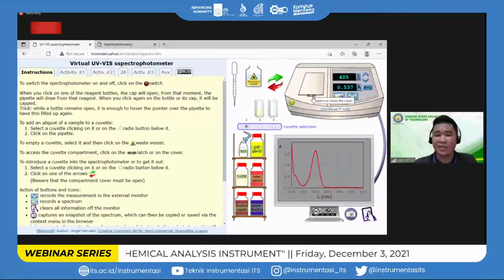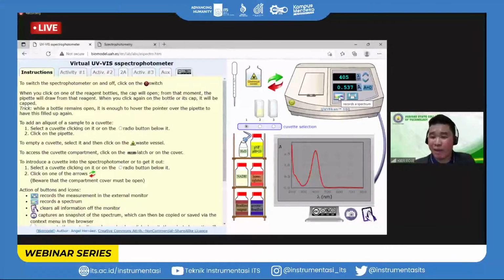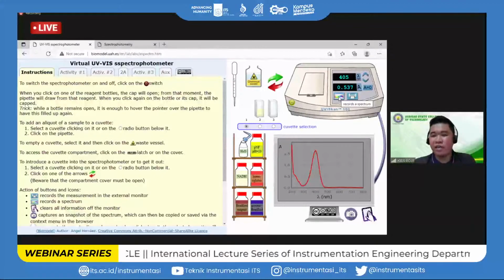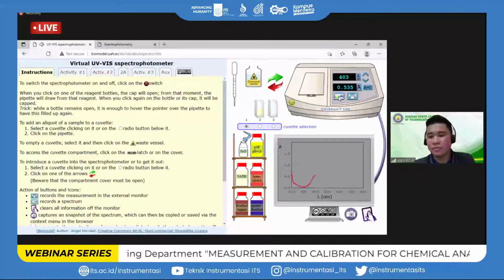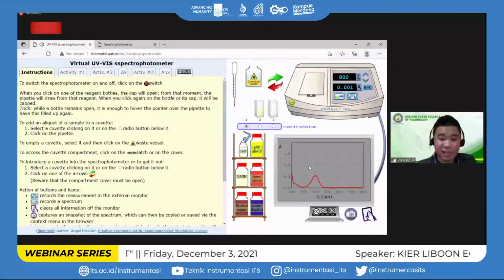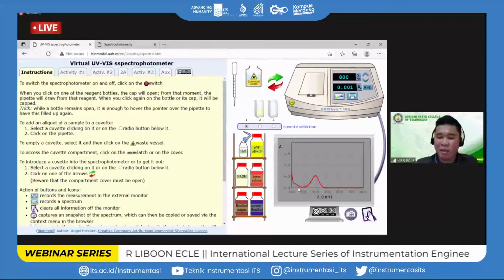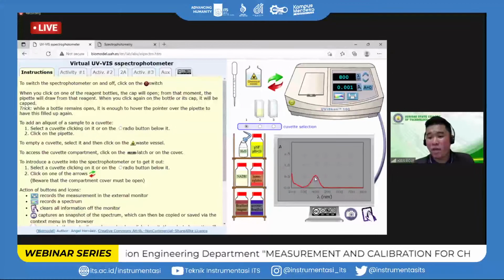That is the absorbance of the first solution that you run in the Vis Spectrophotometer. And do not forget to also record the spectrum of this sample, because you will also need the spectrum in order to better understand your data. This is now the spectrum for your first standard solution, 2:1 ratio, 2 ml water and 1 ml PNF solution.